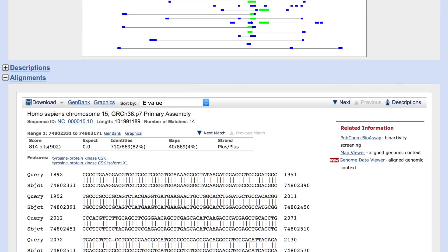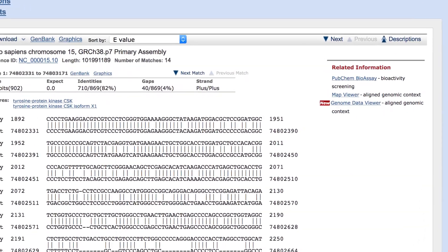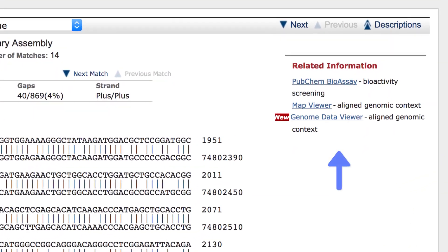Once you have your BLAST results, you will see a link to Genome Data Viewer on the right side of the Alignments section. You may also see a link to Map Viewer, but we will eventually remove that.